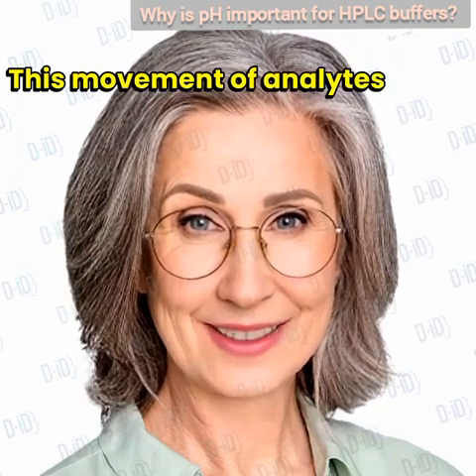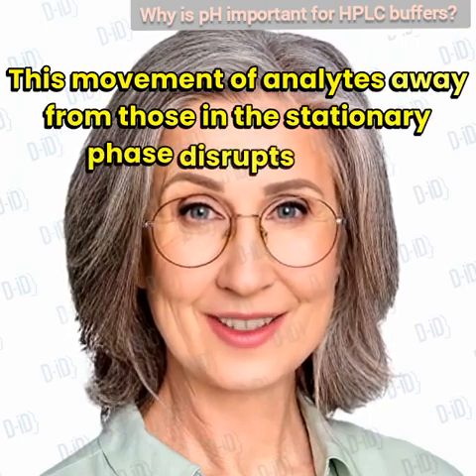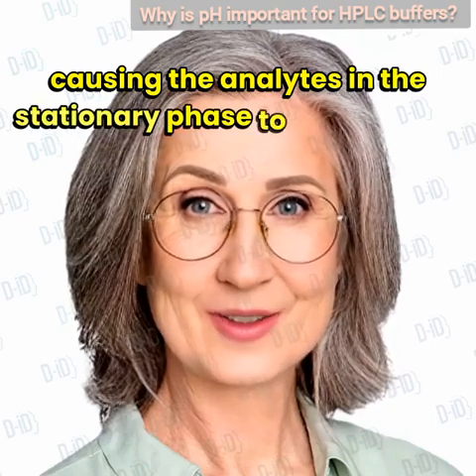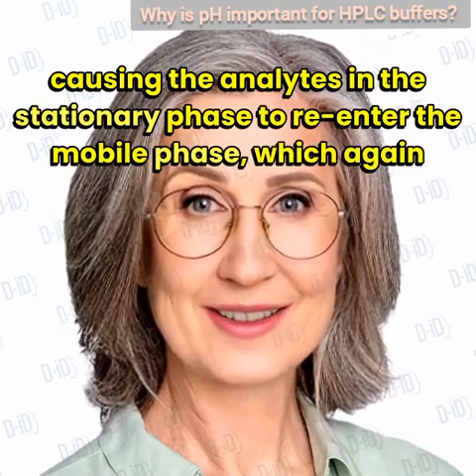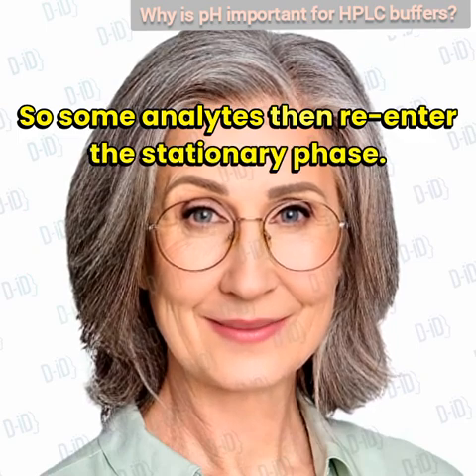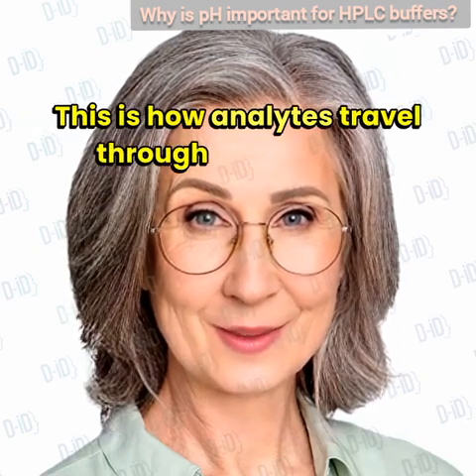This movement of analytes away from those in the stationary phase disrupts the Kd equilibrium, causing the analytes in the stationary phase to re-enter the mobile phase, which again disrupts the equilibrium, so some analytes then re-enter the stationary phase. This is how analytes travel through the column.